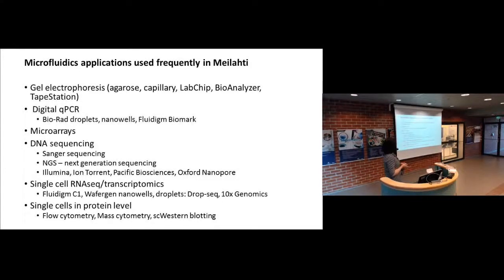We have gel electrophoresis applications, which we do quite a lot nowadays with capillary systems, something about digital PCR devices based on droplets, nanowells, or other chip formats, and microarrays, which are still used in some labs but are now more or less replaced by next generation sequencing, and I'll go through those devices and platforms which are commonly used.